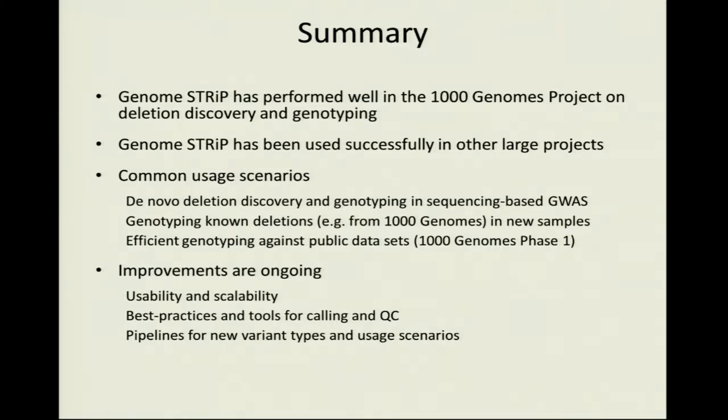Probably the most common usage scenario so far, at least that I know of, is de novo discovery and genotyping on fairly large data sets. But you can also go in and genotype known deletions.